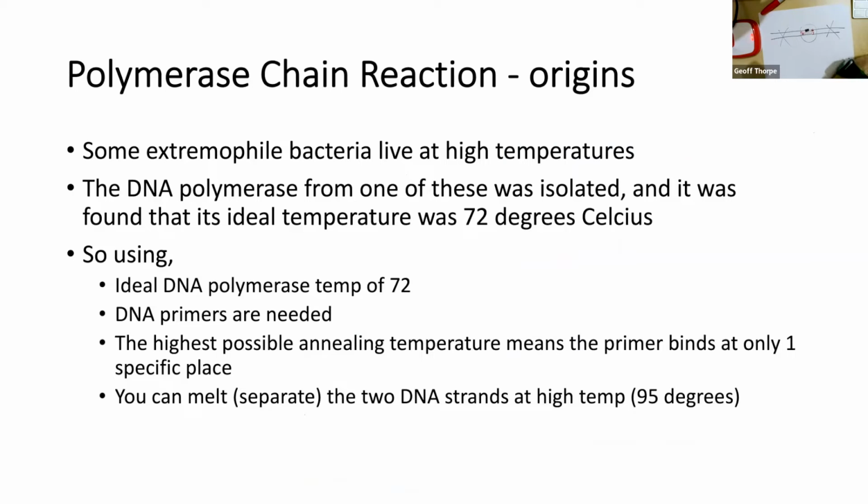So how does PCR work? Let's just quickly go through the origins of it. You don't need to know it in this much detail, but I think this is a really good example of someone putting together a few basic tools and techniques, and actually coming up with something really interesting just with some clever uses of basic tools.